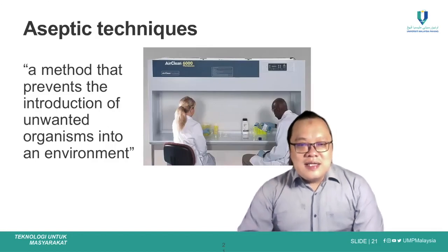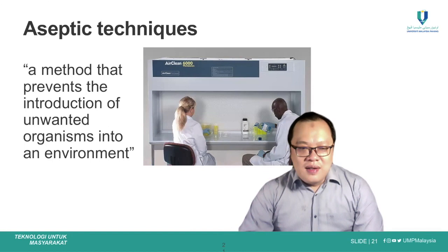Aseptic technique is very important in the microbiology lab, because that is the method to prevent introduction of unwanted microorganisms from the environment into the culture media, so that it will not contaminate our culture media.